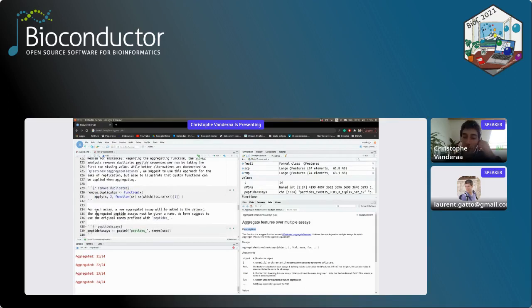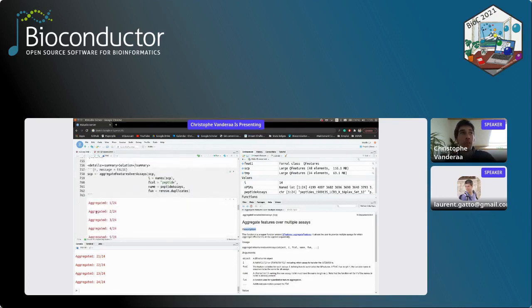But yeah, I know I said it already, but I want to make very sure: if you have your own data, or if you want to reproduce things, or improve things, don't use this. Don't do it at home, please. It's not the right way to go. I would definitely go more for something like co-medians, or even better.